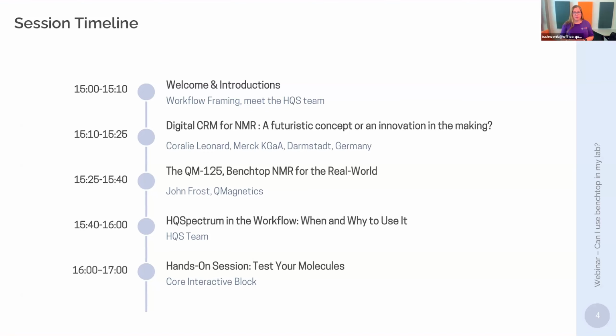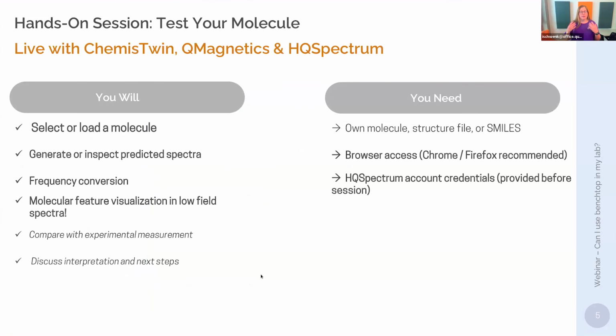Following, my colleagues Konstantina and Florian will present HQSpectrum and how it can enhance your benchtop workflow. Then we will dive into our hands-on session where you can test your own molecules. You can draw your molecules, see how they look like at different benchtop frequencies, see if you can distinguish important features, and also try out different workflows that will enhance your benchtop experience.